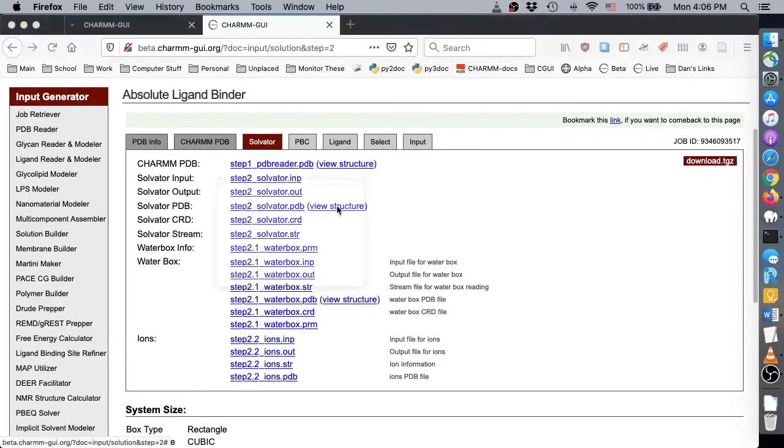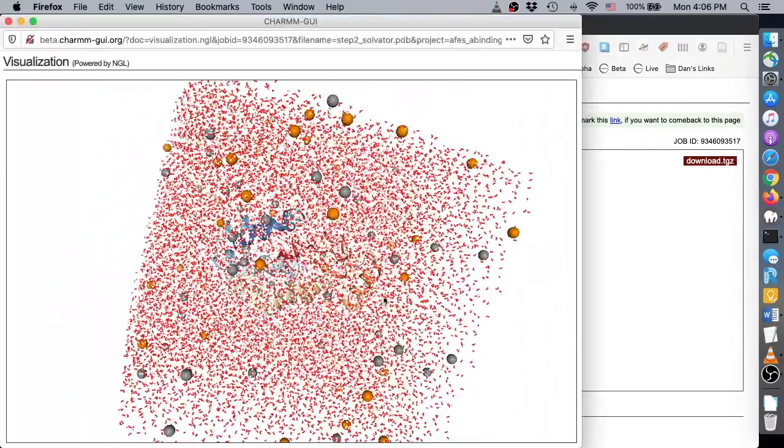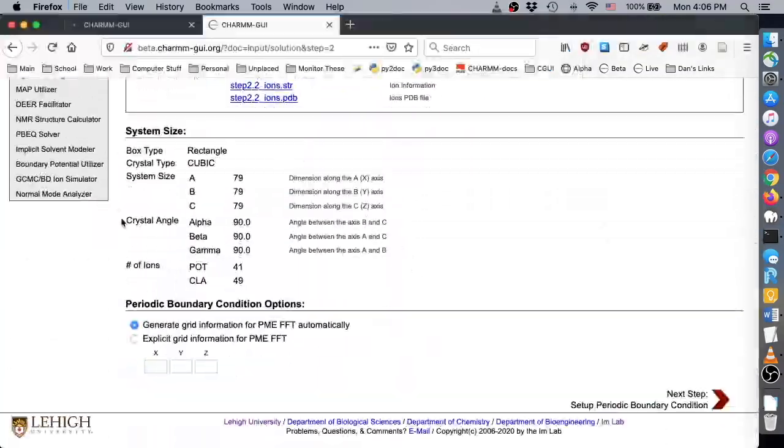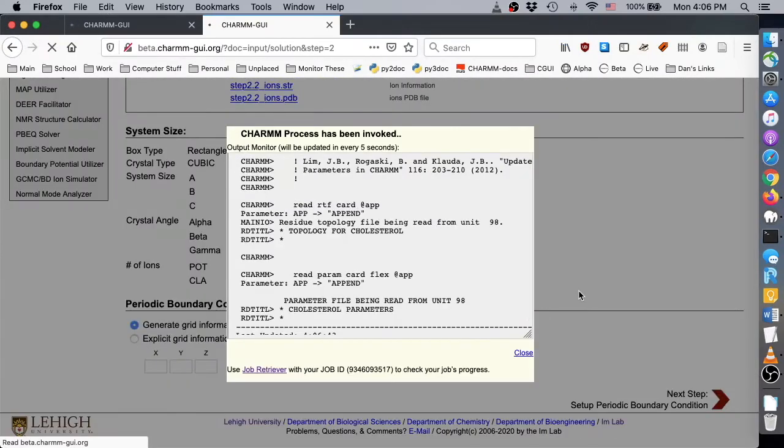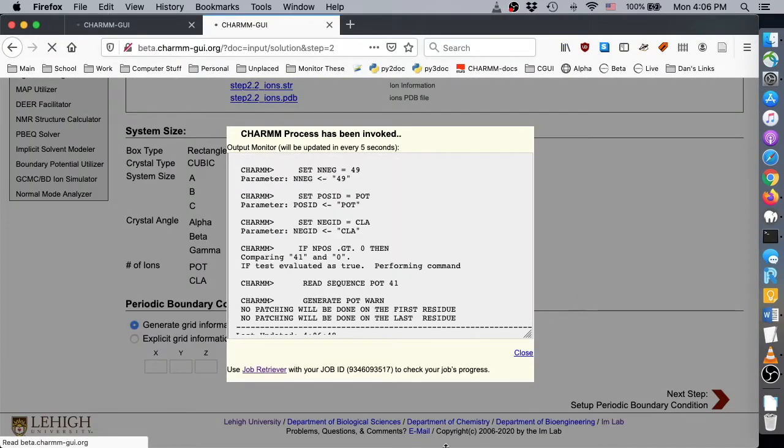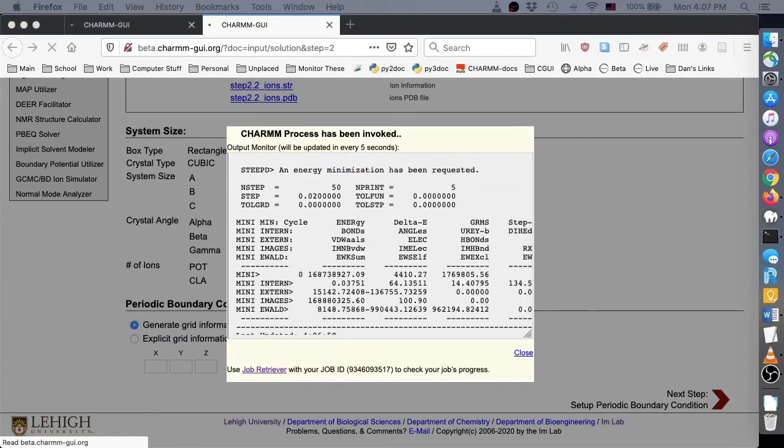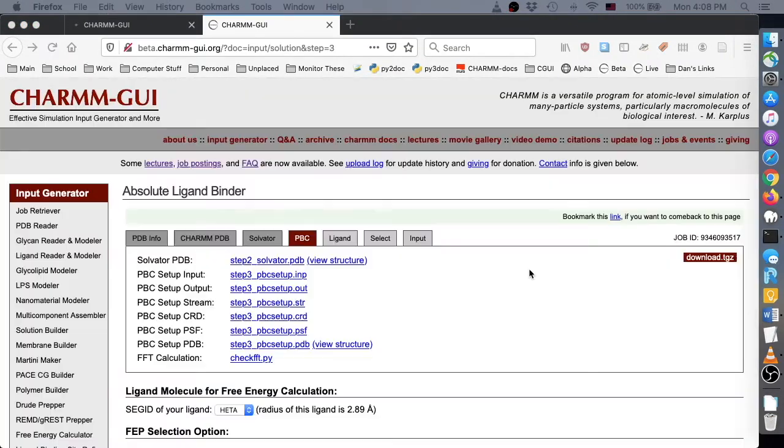On the next page, we can view the resulting solution system and also view the system size details. If everything was assembled correctly, click next to set up the periodic boundary conditions and perform a brief energy minimization.